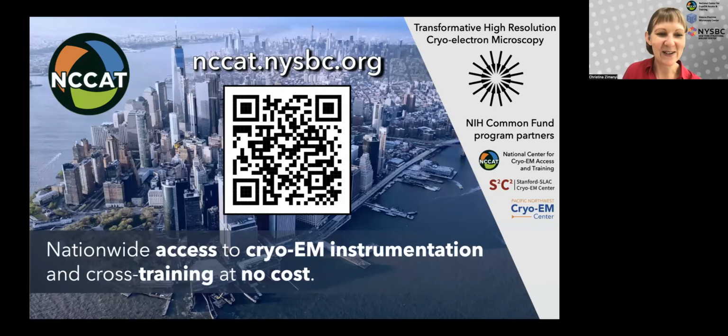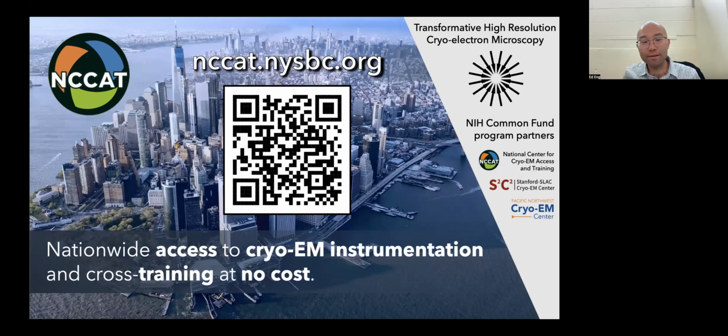Thank you, Mike. Next, I'll turn over to Ed. Hi, I'm Ed here at NCCAT in New York. On the data collection front, this summer is going to be a good summer. We're going to have a 5th Krios coming online. In terms of the screening process, we are building our third Glacios, our Glacios Generation 2. Hopefully we'll get that signed off in a month or so. And on the training front, I know summer is conference season, but fall is also conference season. We're hosting 2 workshops, a micro-ED workshop in November and an integrative structural biology workshop in October. If you want to find out more, you can go to nccat.nysbc.org.